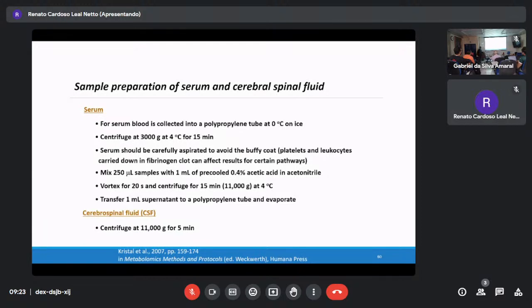And now cerebral spinal fluid. As I mentioned, it's simple: with a centrifuge, you can directly measure. So it's one of the simplest. But what kind of compounds are most common in cerebral spinal fluid? Nucleic acid type compounds. There are many nucleic acid compounds, like adenine, guanine, cytosine, thymine, or their derivatives. That's because it's a neurotransmitter case, and those cases carry very full information.